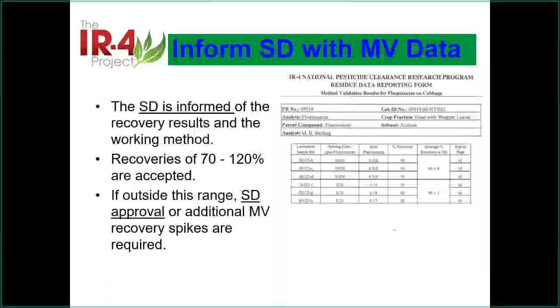And we have one set of results here. The most important thing on top is to talk to the study director about whether your data are good or not good. It depends on how you do the work. If you do the work, you do not have to put the control there because we know control is low. And if you put a control there as a comparison, good. So this is one thing.